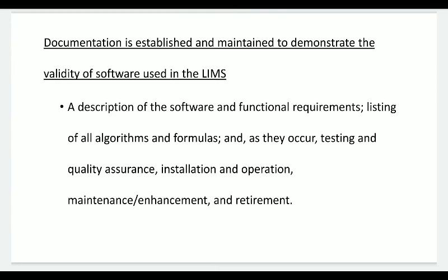Okay, so whenever a quality assurance unit is visiting LIMS department, they may ask you to give a documented proof of the software which you are using to operate LIMS. So even though we have that software in computer, separately we have to maintain a document which shows the functions of particular software, what kind of algorithms are used by the software, what kind of formulas the given software is using, what is the testing frequency. Likewise, a detailed information should be documented.